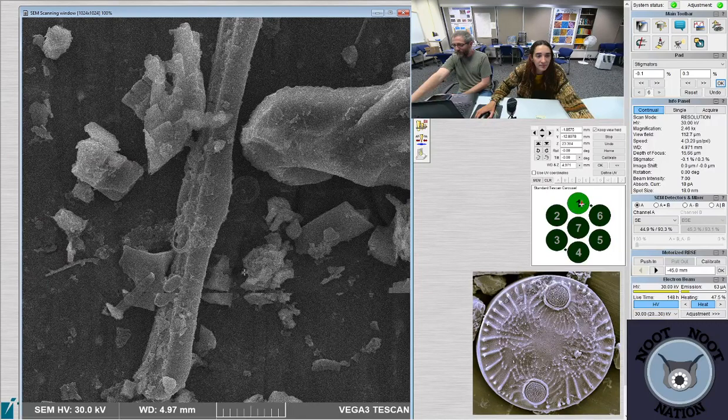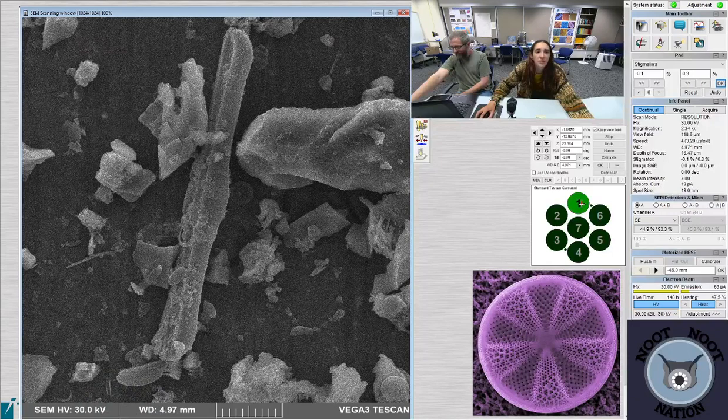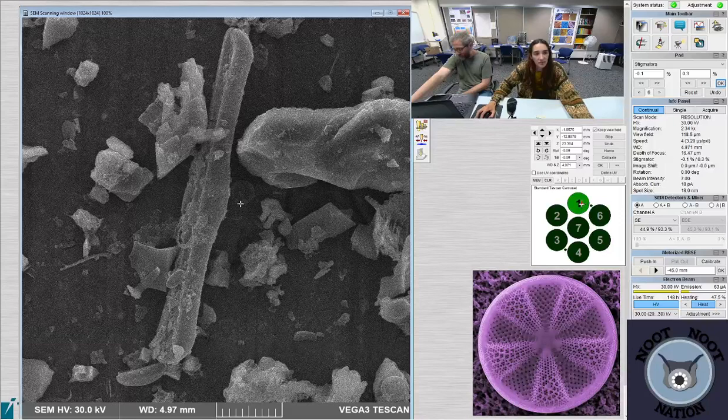Let's see. These ones are Rhopalodia? Yes, that's Rhopalodia gibba. But they're now Epithemia.